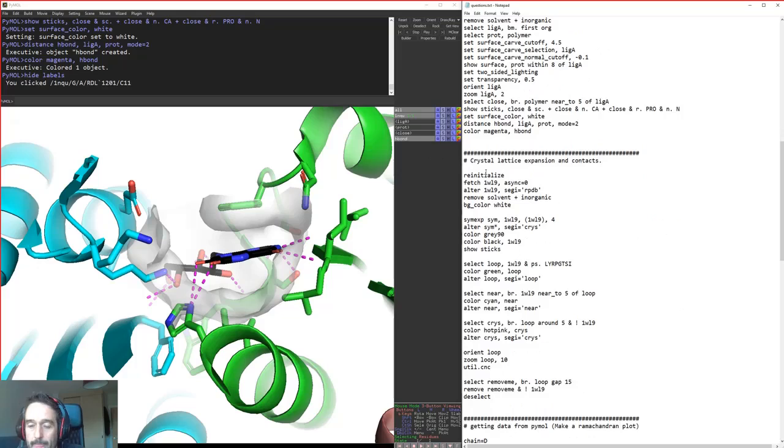Okay, so still talking a little bit about proximity selection, but how to use that in different ways. I've also got a question about crystal lattices and how you can tell whether you have amino acid positions in places that are responsible for the crystal lattice interactions rather than for a biological function of some kind.